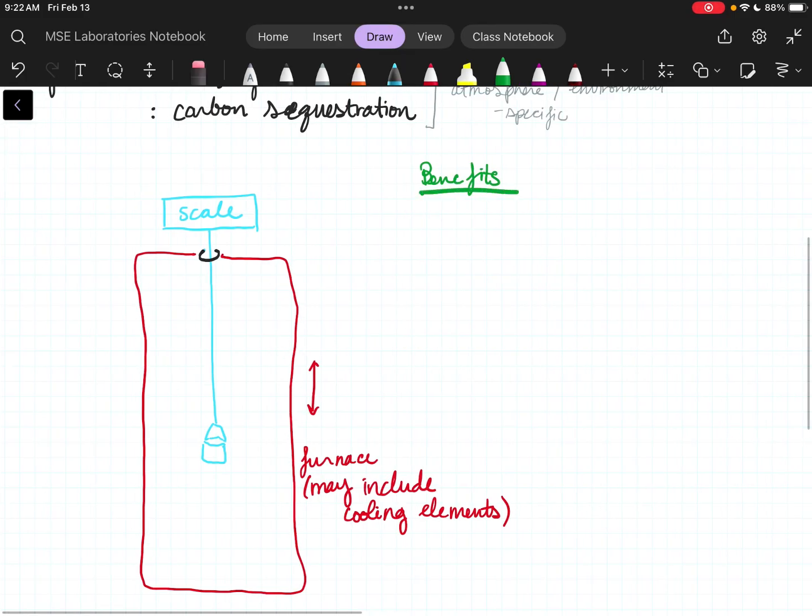Because generally people don't do both, and so the machines that do both are expensive and not very many people make them. So a lot of why get it when you don't need the option? Exactly. Even in our lab, where we are a generally accessible research space that does testing on behalf of a ton of different projects, we just have two different instruments. We have an instrument that goes cold and we have an instrument that goes hot. And they can both be sensitive in their kind of line of work. I don't have to worry about having one instrument that covers everything.